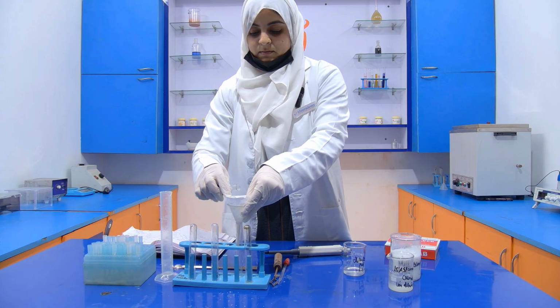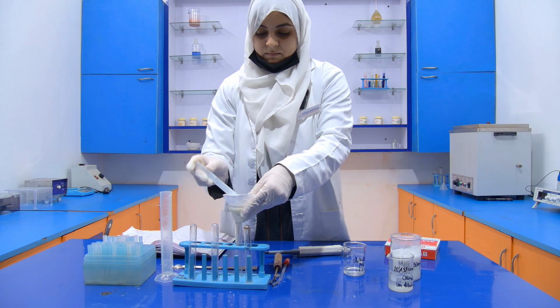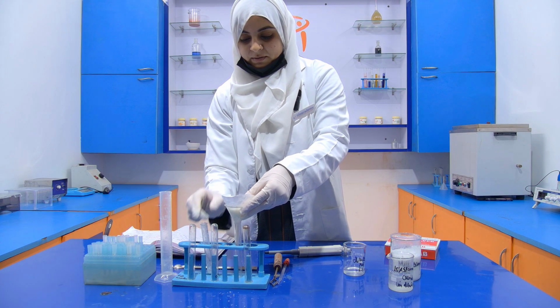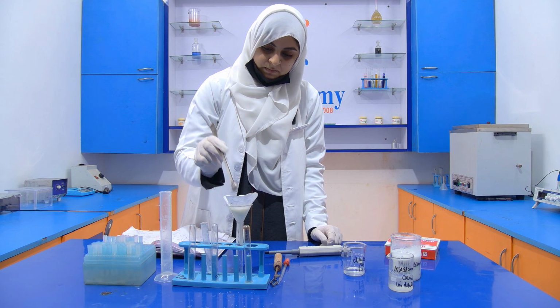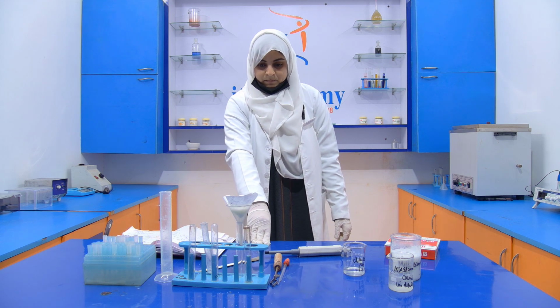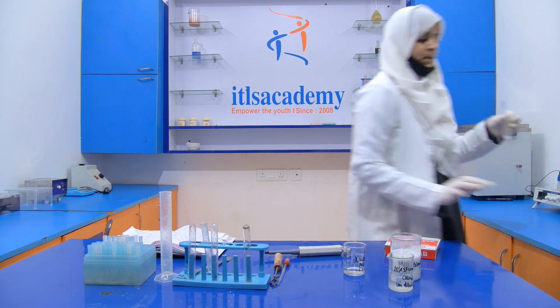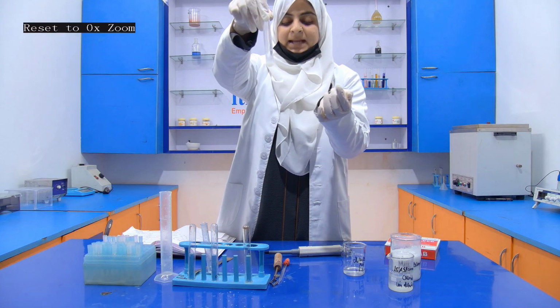Now we get the filtrate very slowly. See, after filtration we get a filtrate which is a milky color.